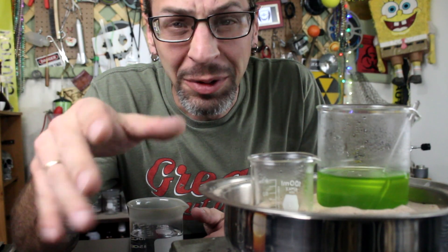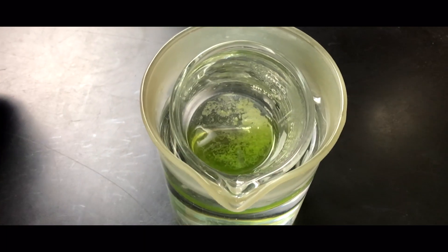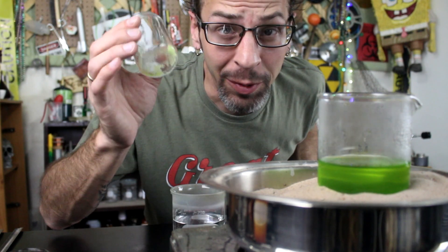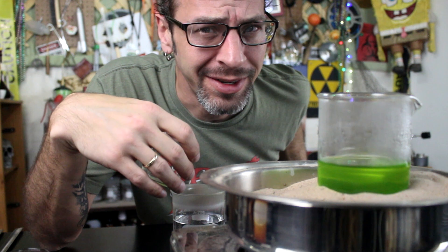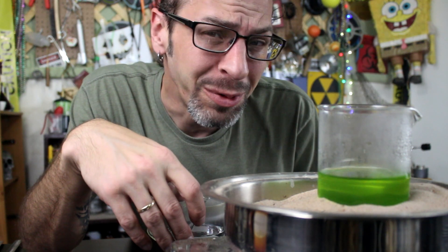It looks like our small beaker is getting close to that point, so we're going to go ahead and pull it out, cool it down, and see if we can get some crystals. I'm just going to put it into a beaker of cool water and see if we can get a little crystal growth. It worked! We have sodium ferrioxalate crystals — look at that. There are just a few in there, but imagine what we're going to have. So now we're going to reduce the volume of the big solution and let it cool down very slowly instead of rapid cooling it, so we get larger crystals.